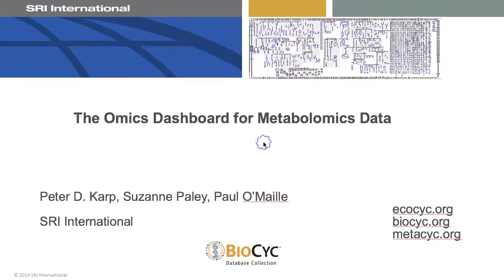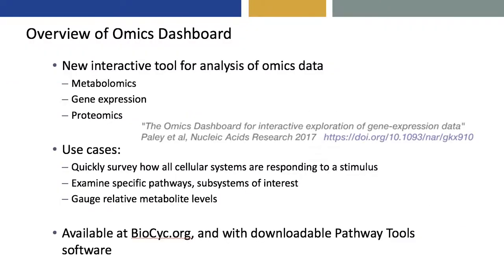This is Peter Karp from SRI's Bioinformatics Research Group, and today I'll be talking about a new tool for analysis of metabolomics data called the Omics dashboard. An overview of this tool is that it's an interactive visual tool for analysis not just of metabolomics data, but also of gene expression data and proteomics data. And it has several use cases.